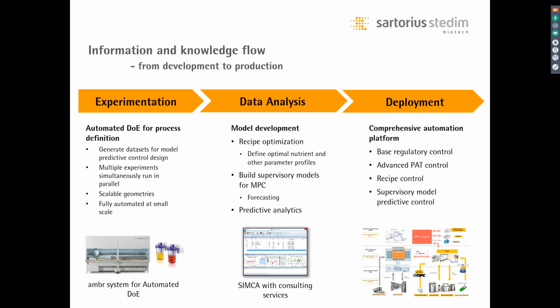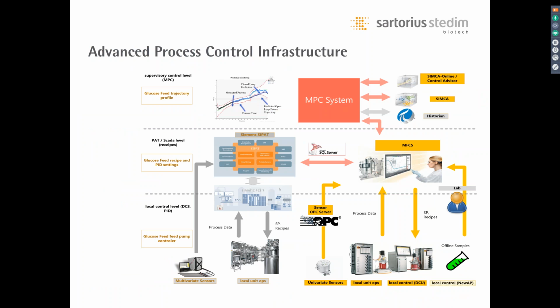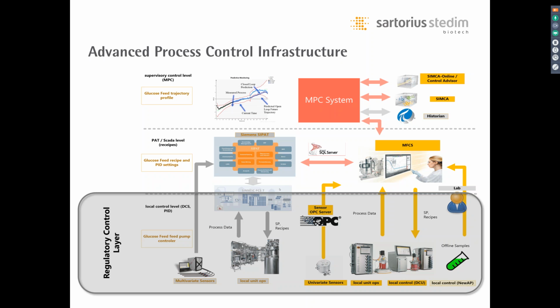are these predictive analytics? Does it look like we can forecast and do all of these types of studies? And then we have now much more options on the deployment side, I'm speaking of the SIMCA-online and control advisor piece, but with all of the pieces from Sartorius now, we have a much more comprehensive ability to fill all the layers of control. And if I get a little more detailed into all the different layers of control, we can build nice, extremely complicated and messy slides like this, and I won't dwell on all the different pieces, but we can now fill all layers of control, where at the base, we have our regulatory control layer, and so we have partners and our own tools for doing this.